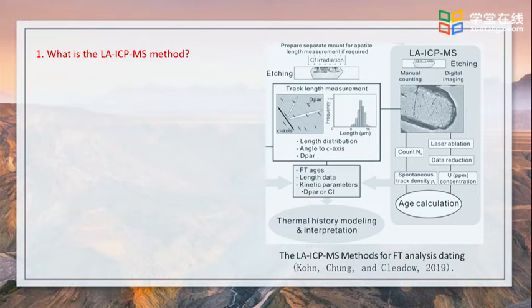ICP MS for direct determination of uranium-238 is a relatively new approach to fission track analysis. It is the first technique that has been able to compete with the traditional neutron irradiation method for determination of uranium-238 content in terms of high spatial resolution and ppm sensitivity.